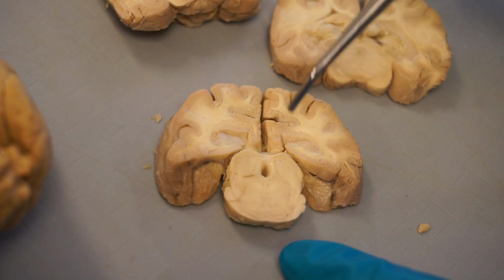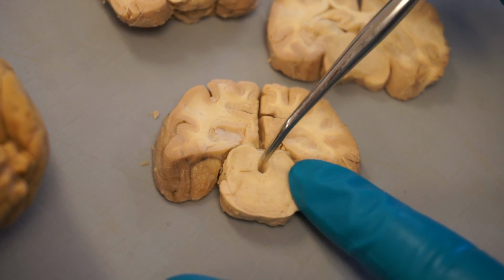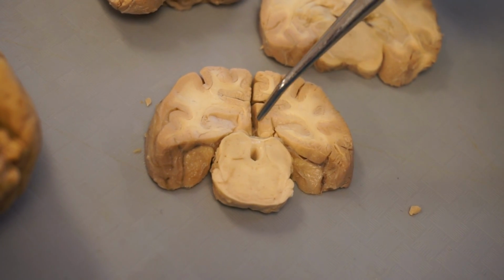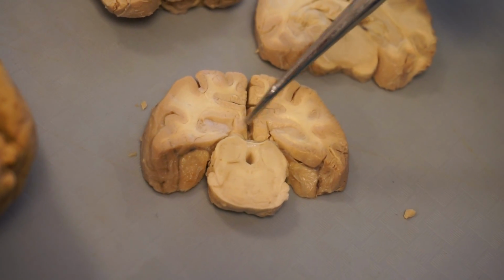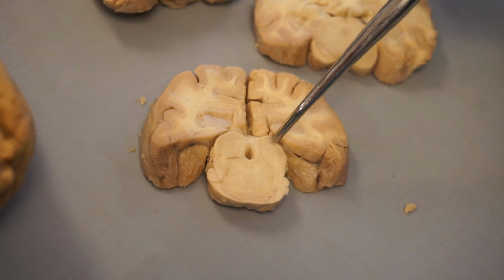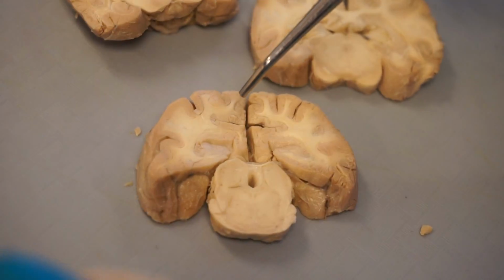The other thing we can see in this is that the mesencephalic aqueduct was small, and now it's starting to open, and will ultimately open into the fourth ventricle. These two masses on either side here are the caudal colliculi.